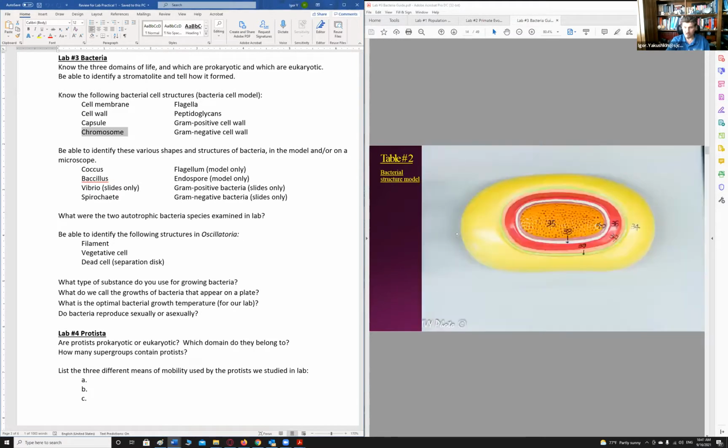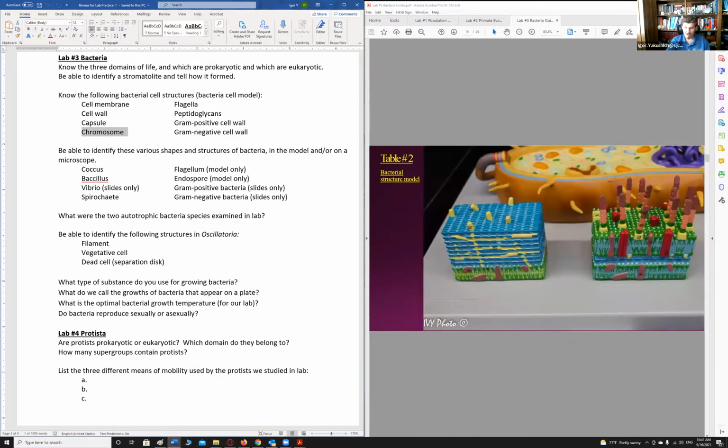So that one, yeah. Here we have the spore or endospore, and here we're looking at the 2 cell walls, right? This is the cell membrane, this is the cell membrane. Now we're looking at the cell wall. That one is pretty much completely made out of peptidoglycans, so it's a gram-positive cell wall. Here we have a thin layer of peptidoglycans and then lipopolysaccharides, so that would be a gram-negative cell wall. Remember, gram-positive should stain the wall bluish purple. If it's not bluish purple, usually pink, it will be gram-negative. But Treponema is actually kind of brownish reddish color, but it's still not bluish purple.